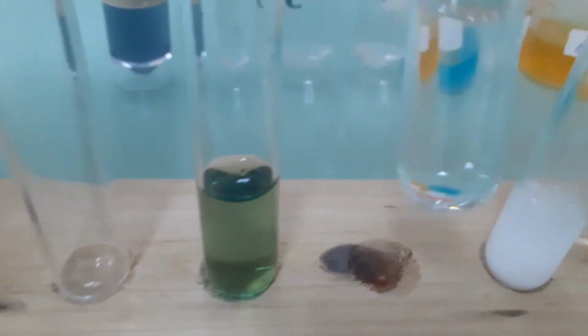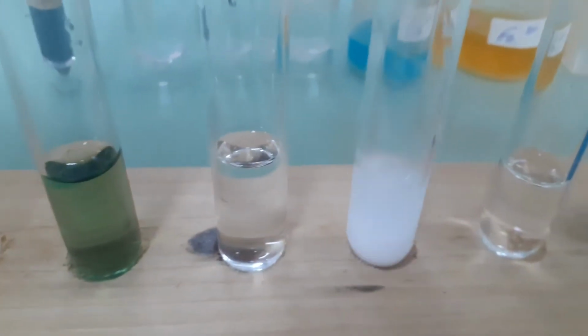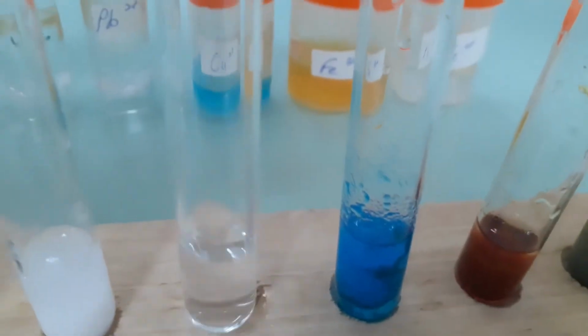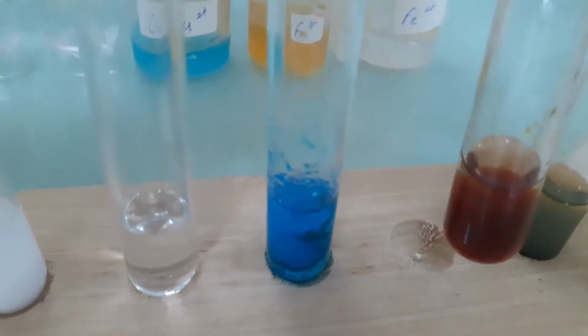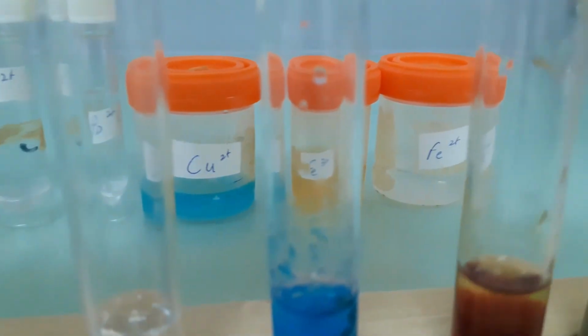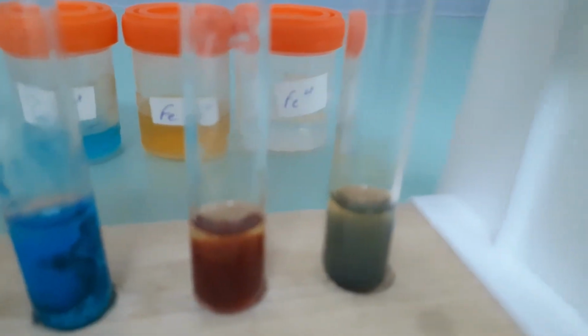Then we have the zinc. Then we have calcium, lead, copper 2, iron 3. Notice how the solid settles out of the solution. And then iron 2. Please take your observations.